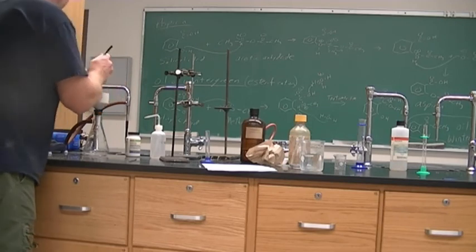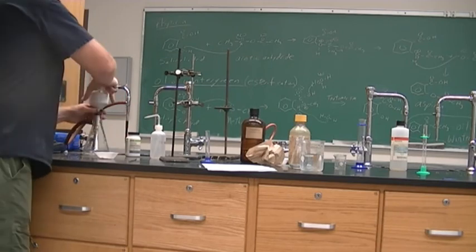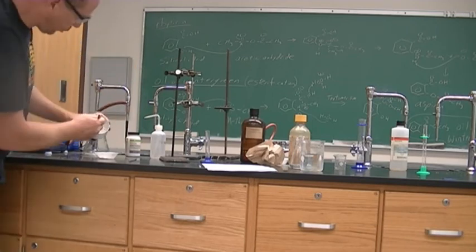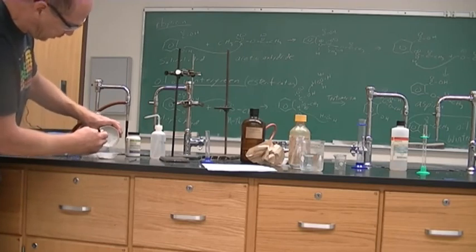I got a lot of it out, and I will take it off of the filters. Now you can hear the air getting pulled through. And then I'll pour the rest of my solid on here.